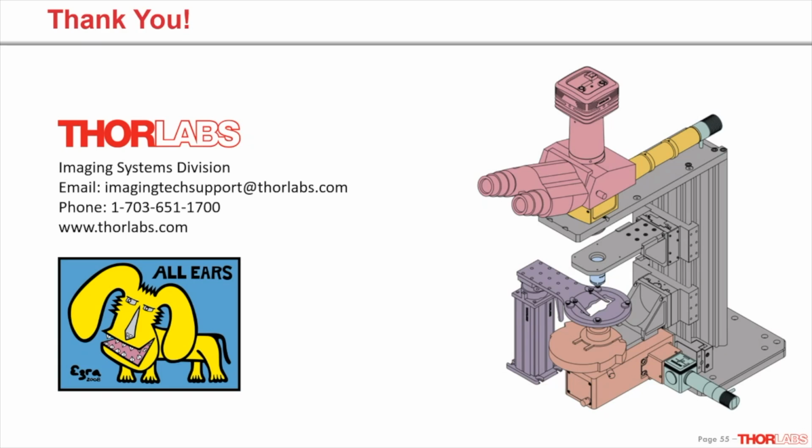I have a follow-up question here. Basically, could you explain the aspects of Kohler illumination in reflection mode, and would it differ from those in transmitted mode? Honestly, I don't know, because Kohler illumination, in terms of the transmitted light pathways, is for transmitted light.